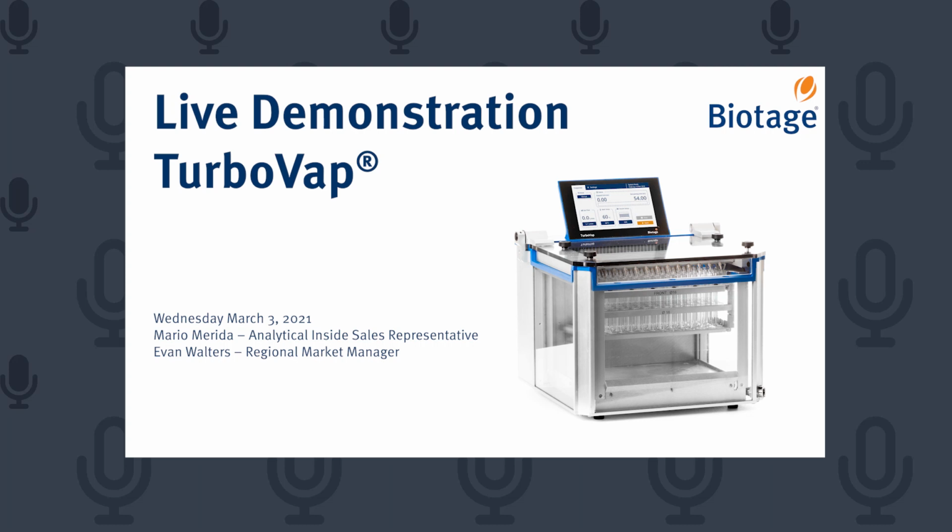Good afternoon, everyone, and welcome to our live TurboVap demo. Today, we're going to show you the new features and benefits of the TurboVap systems.